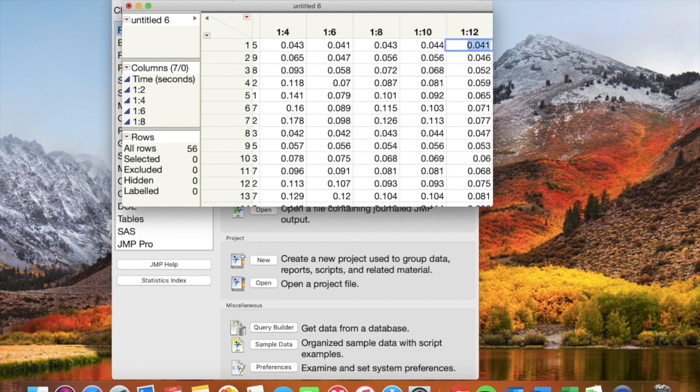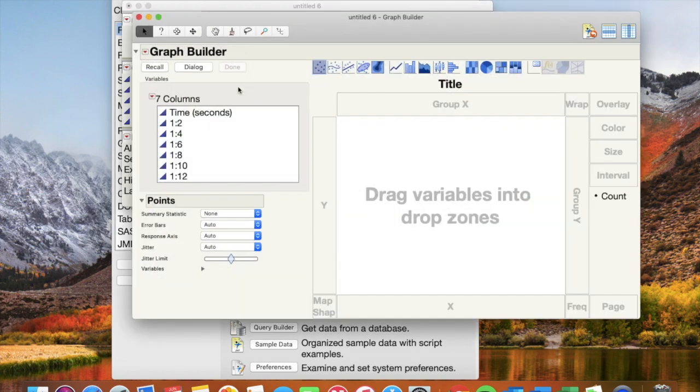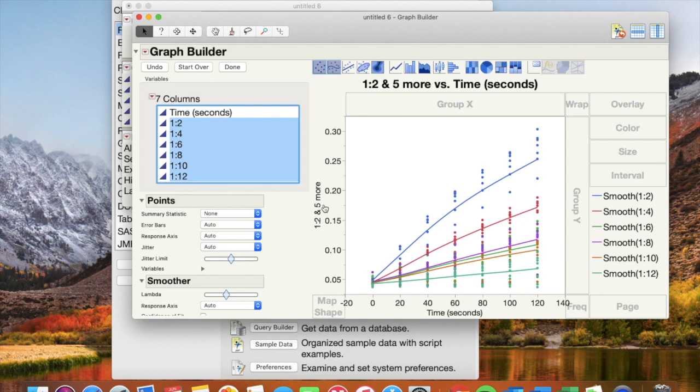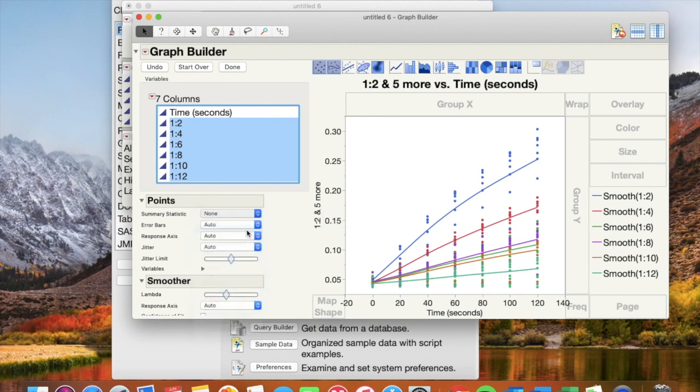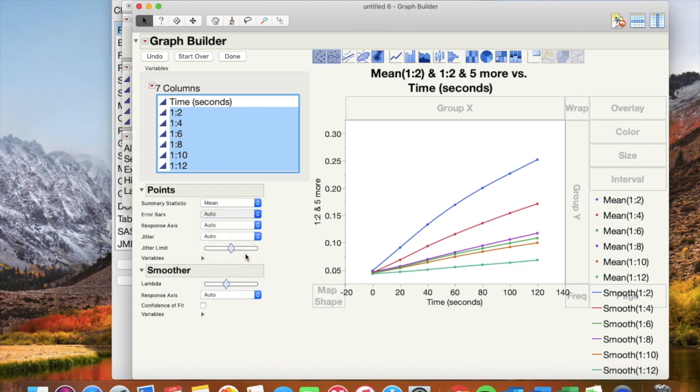Click graph and graph builder. Time in seconds will be on your x-axis and all the dilutions will be on your y-axis. Drop down to summary statistics and choose mean then error bars and pick standard deviation.